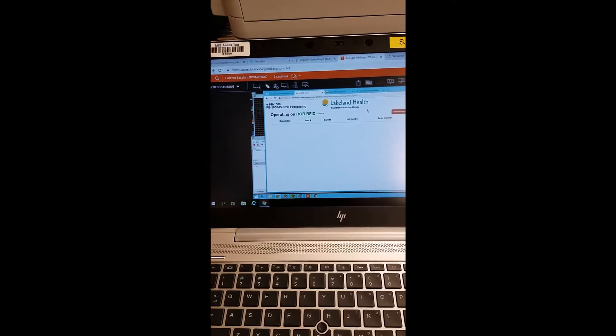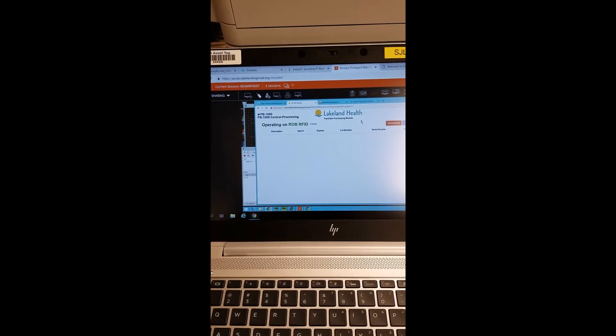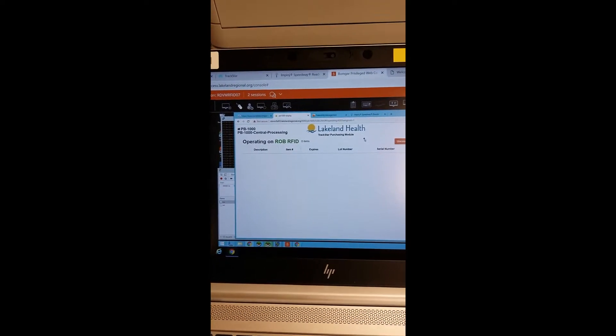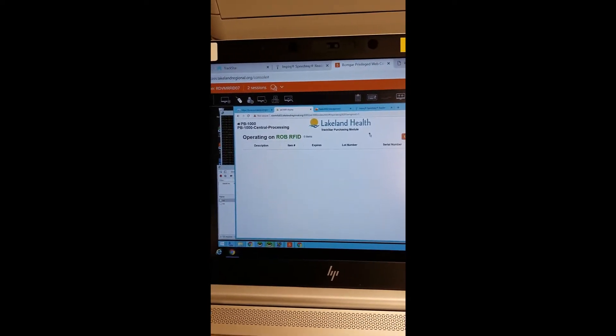Harold here. I'm looking at the PB1000 screen — it's completely empty for the consumables log. We're operating on RFID. Right next to me is the PB1000, and I've got 55 tags for consumables. We're going to drop all 55 in at once.